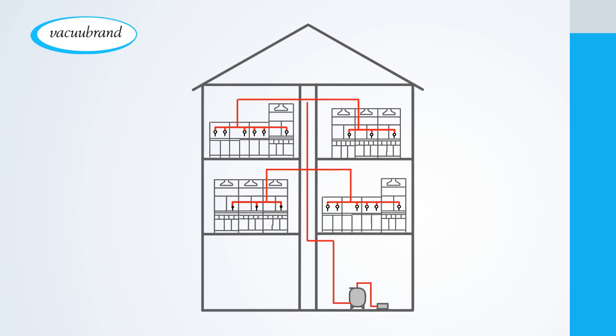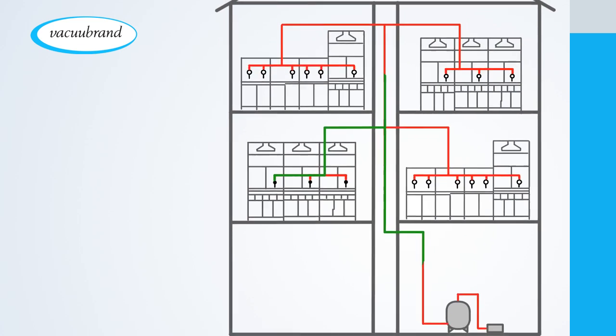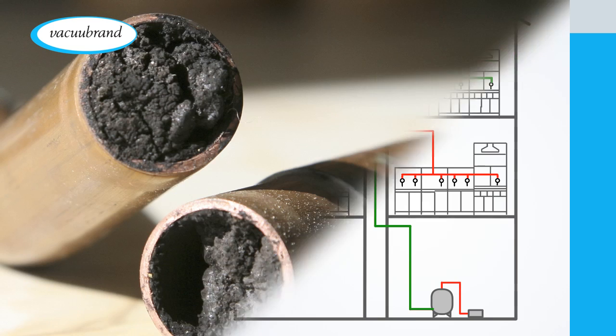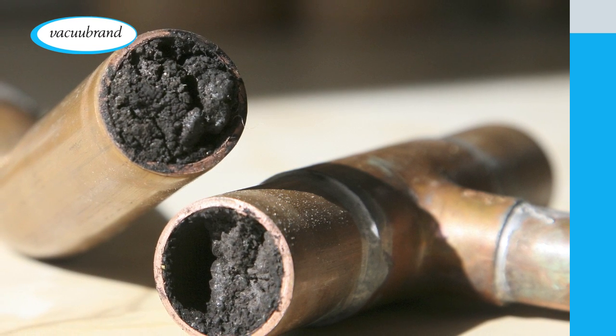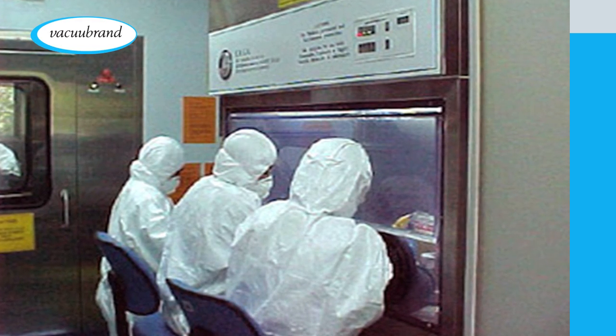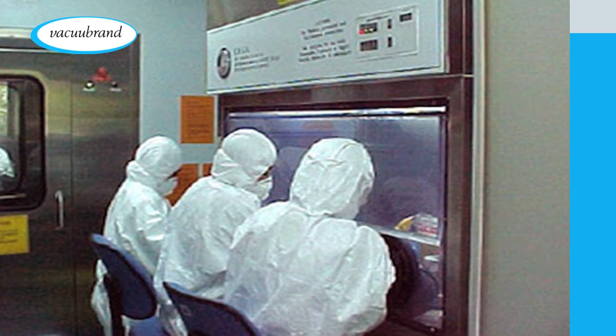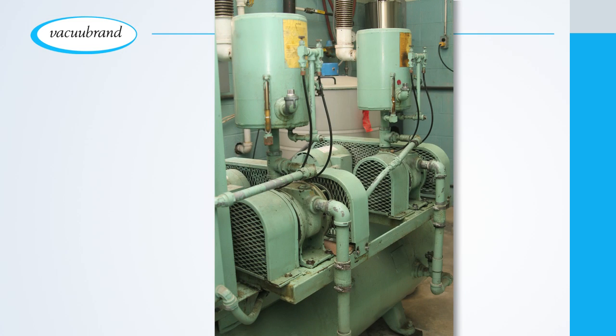Central vacuum is also a problem when you need to isolate applications. Think about it. The central vacuum system sucks the vapors from your project behind the walls, where they may contaminate research in other labs and condense into a toxic sludge in the pipes that reduces building vacuum performance over time. You certainly can't use central vacuum in a BSL-3 lab. You need to isolate your operations. For all these reasons, many modern lab buildings are being designed without central vacuum systems.